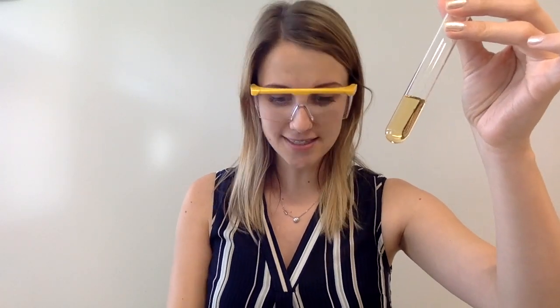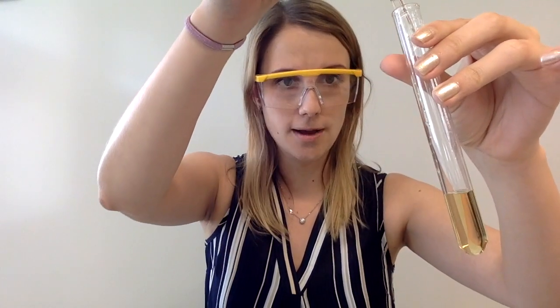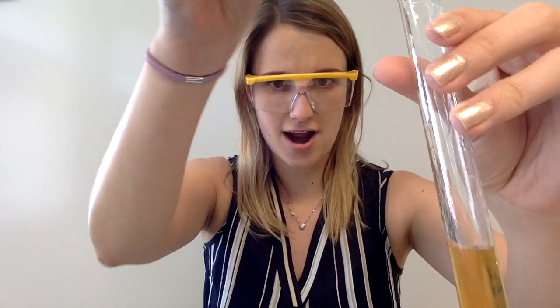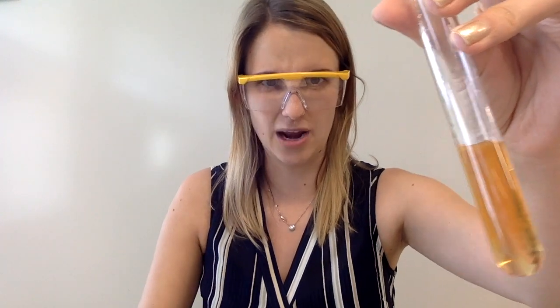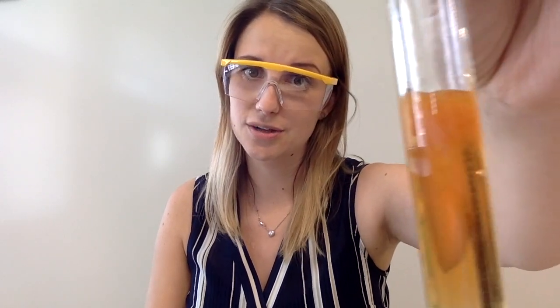If I take another sample of iron 3 plus, let's see what that does with the ammonia solution. When I add ammonia, you can see that you get that same red-brown precipitate. It's not forming in quite the same way as the other one, but you've still got those solid particles there. They're also insoluble in excess, so you've still got that red-brown precipitate forming with the ammonia too.